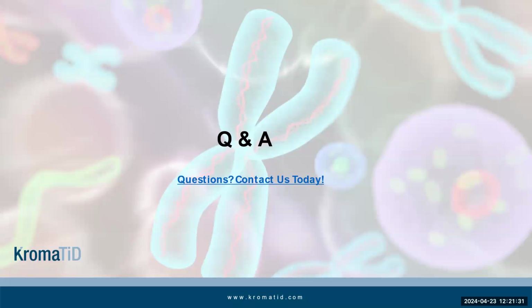Great question. I would say that DGH fits in with these methods and can be used as the cytogenetic ground truth when these methods struggle with complex and heterogeneous structural variants, especially those with breakpoints in repetitive regions. Both methods mentioned are essentially extrapolating a picture of what the genome looks like in silico from measurements based on sequence alignment.